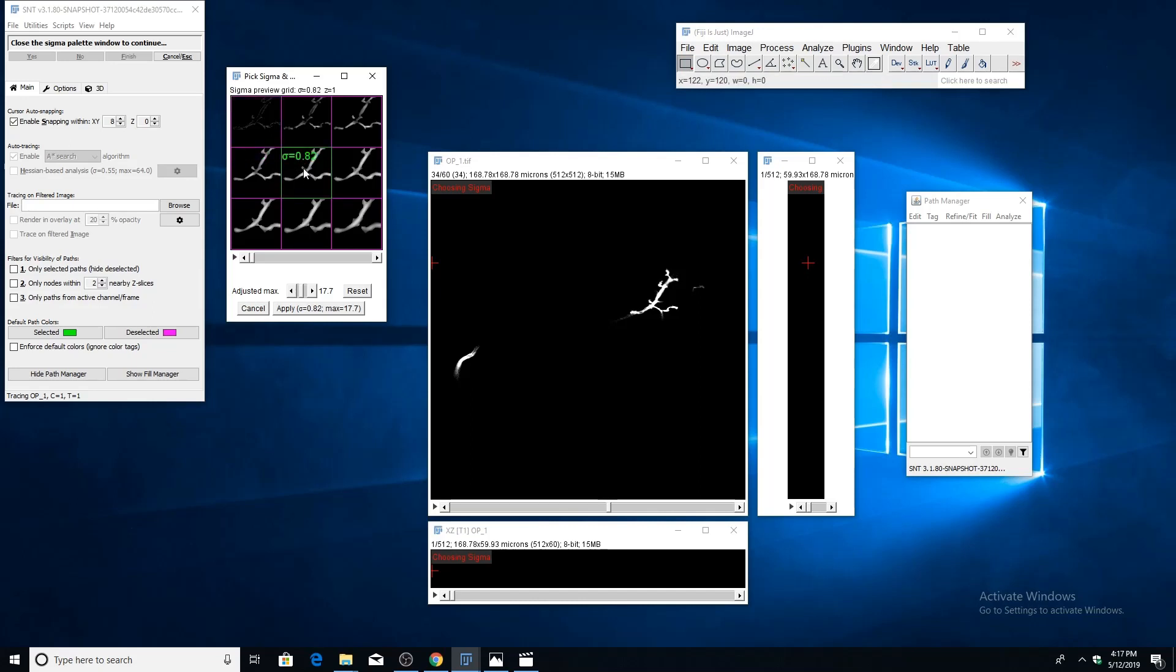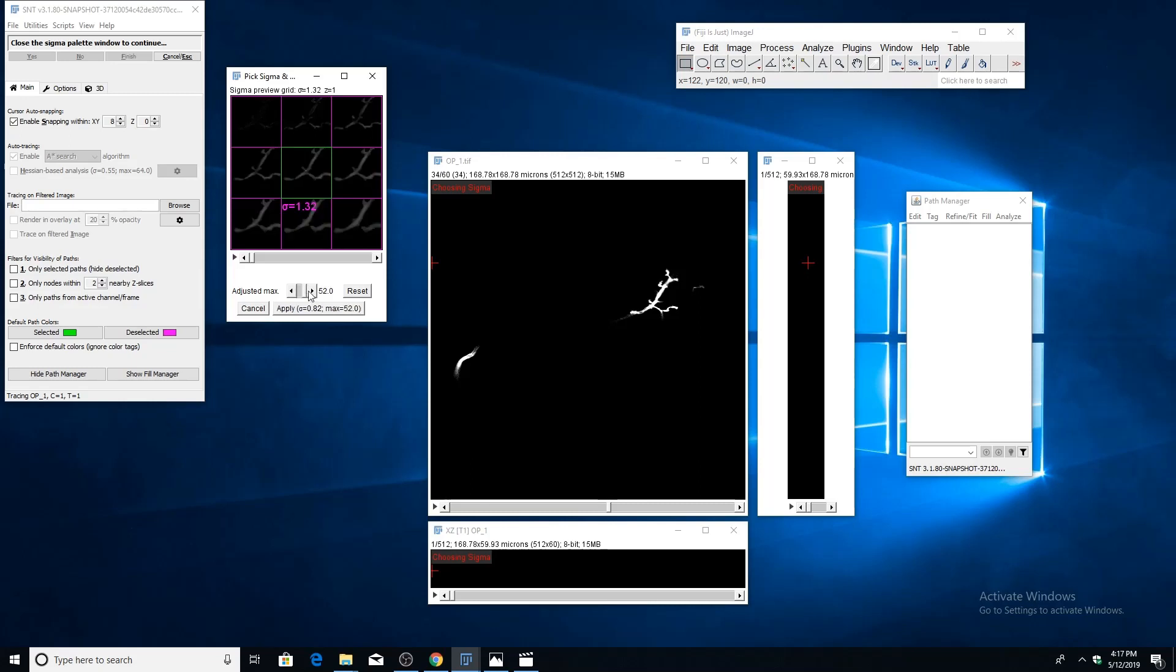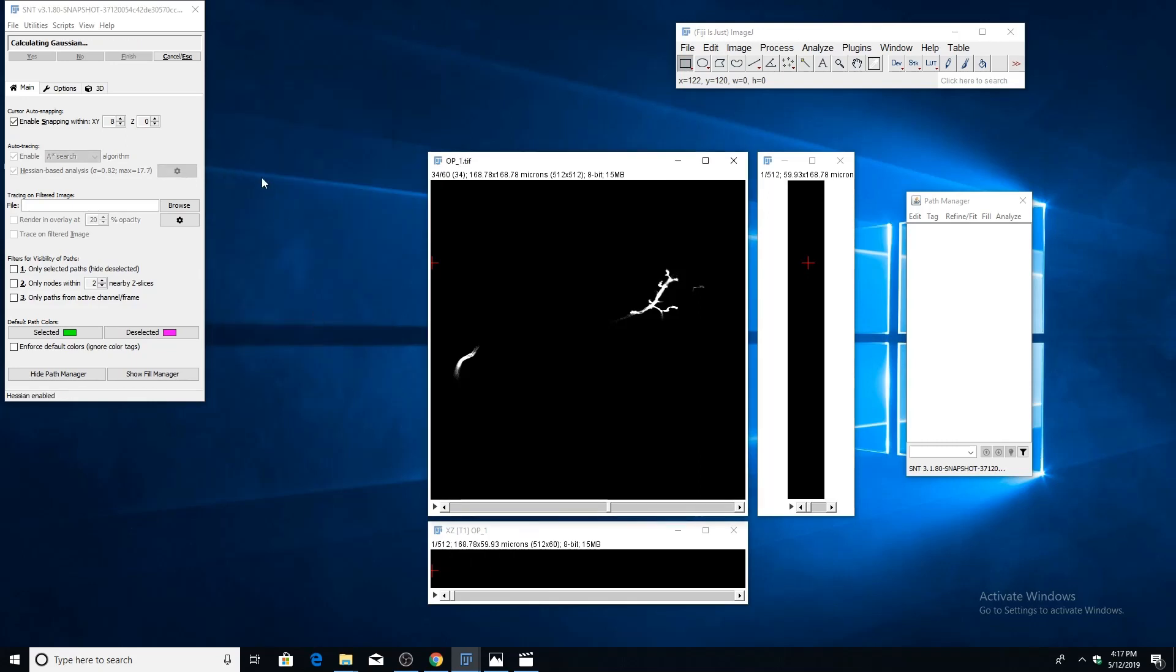If you click that square, it'll turn green, meaning that value has been selected. You can also experiment with moving the adjusted max to find a setting that captures the structures you're interested in. But make sure it's not oversaturated or undersaturated, as this can negatively affect the quality of the result. It's usually safe to choose the default value. Once you choose your parameters, click apply, and it'll run a Gaussian convolution over the image. Once that's done, all the pathfinding will occur on the computed tubeness image.